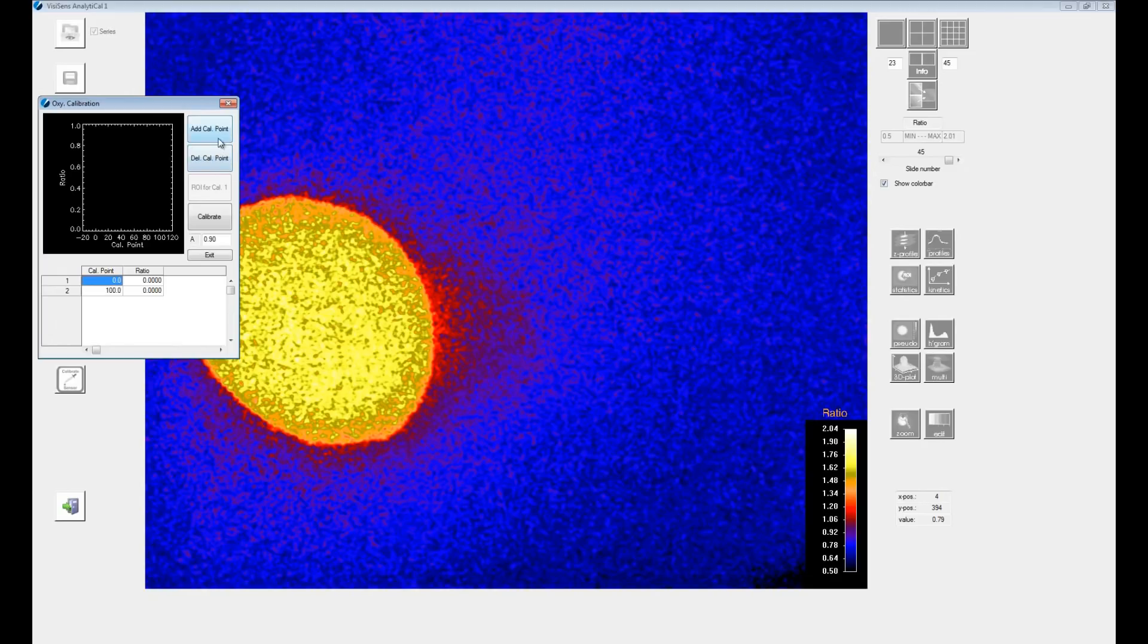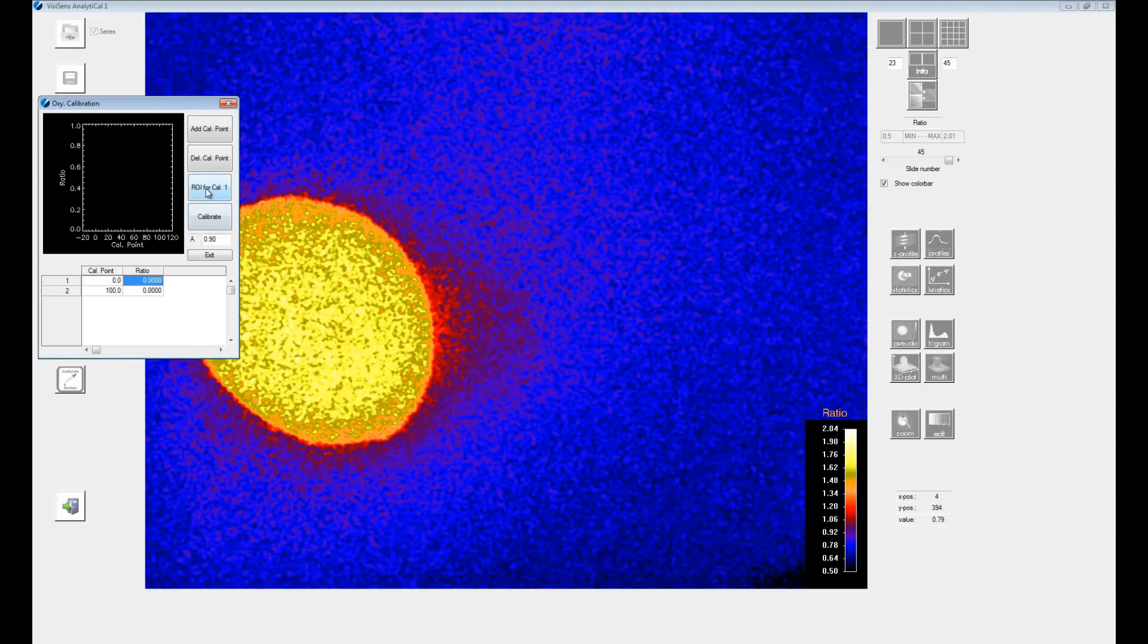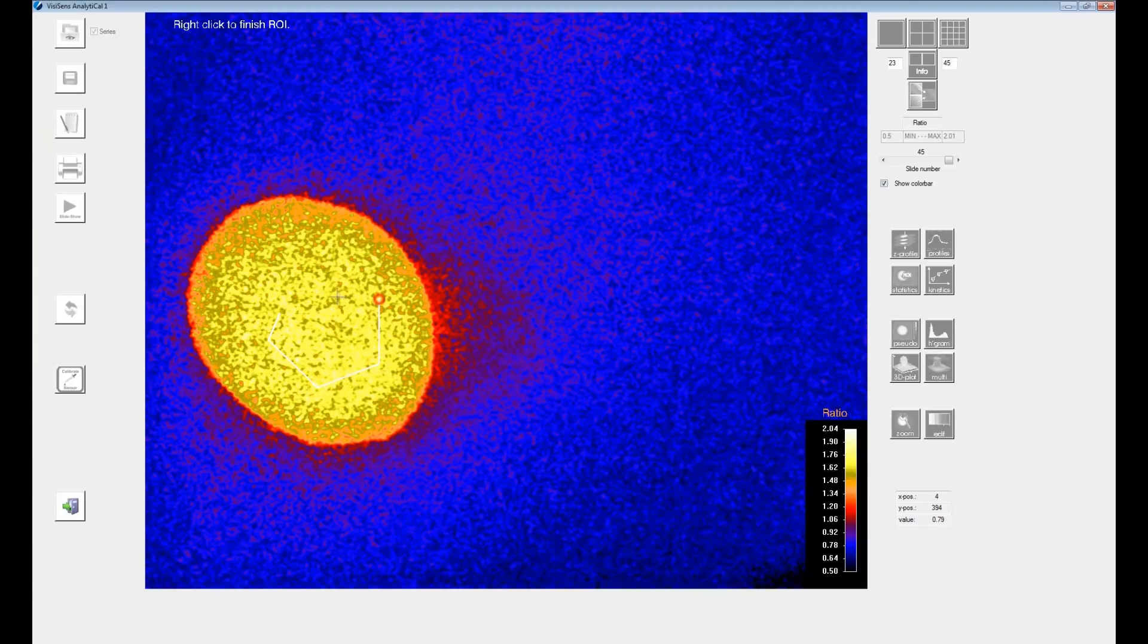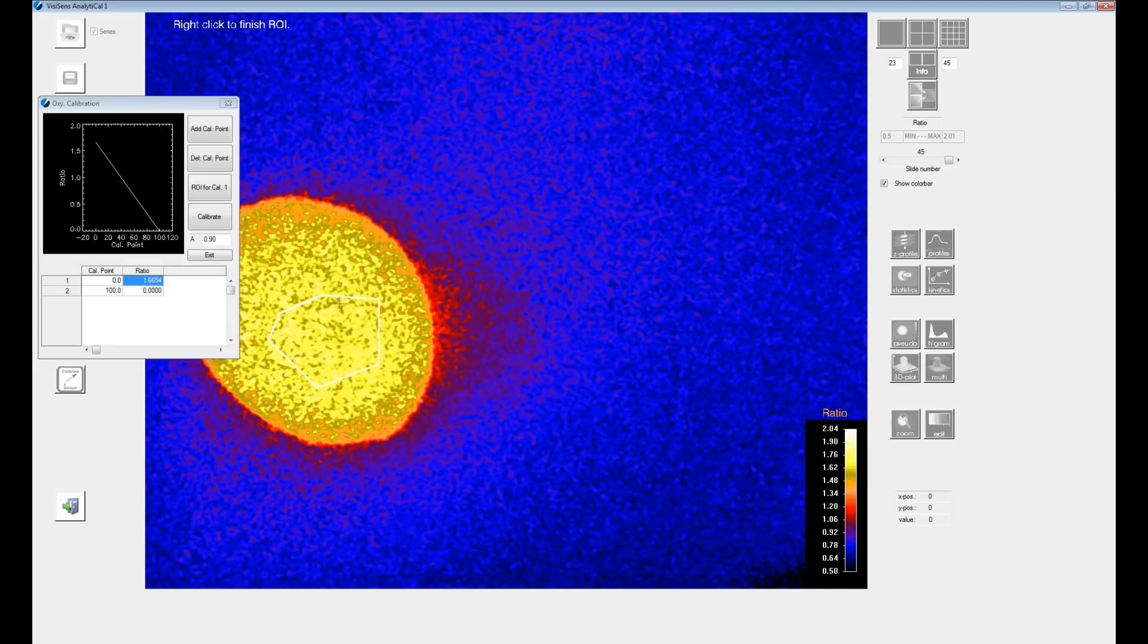For performing the zero point calibration click on the ratio cell next to zero. This enables the ROI button. Click on it and select the respective region in evaluation display where the sensor responded to zero percent oxygen. Here inside the sodium sulfide drop.